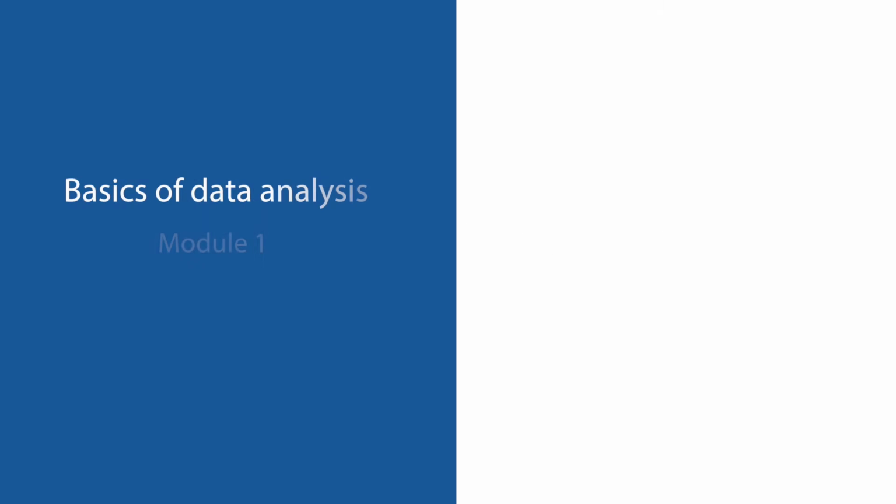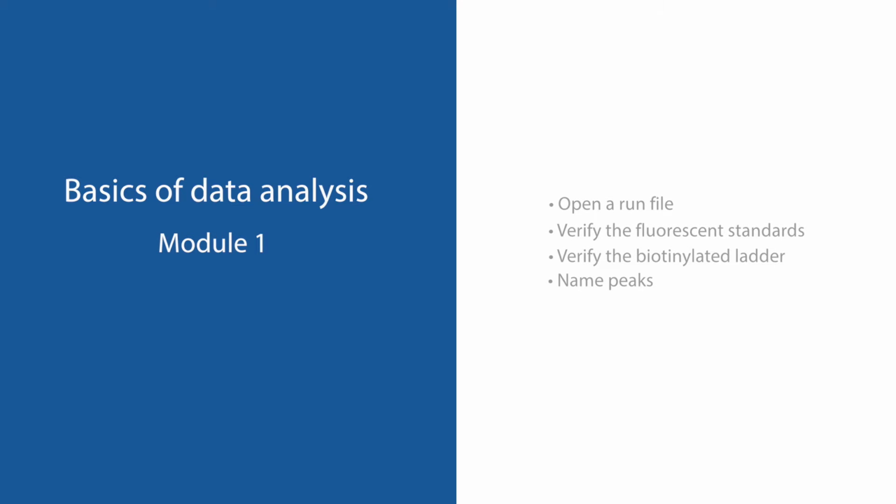Data analysis is going to be a breeze, so follow along with Module 1 to learn how to open a run file, verify the fluorescent standards, verify the biotinylated ladder, and name peaks. Ready? Let's get started.